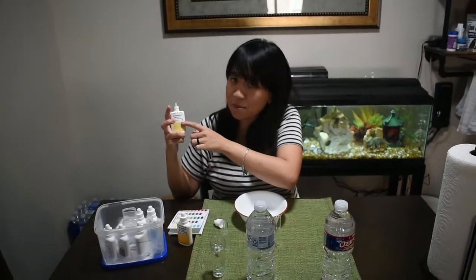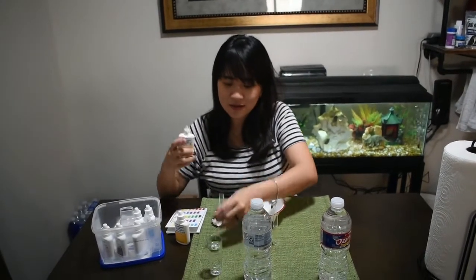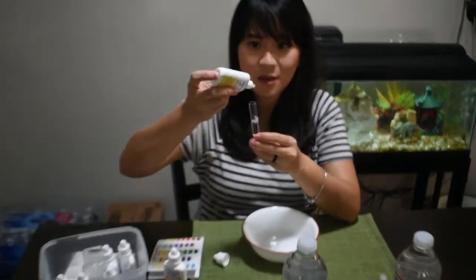This is the first one, bottle 1, 8 drops. So you need to hold it upside down like this.